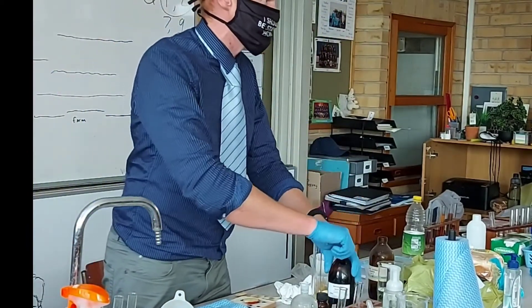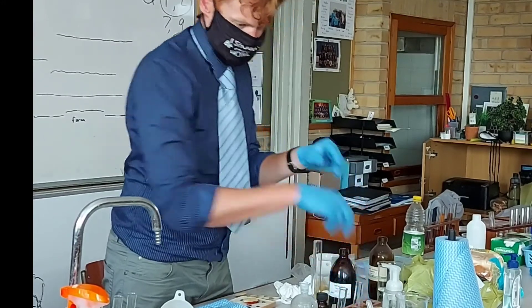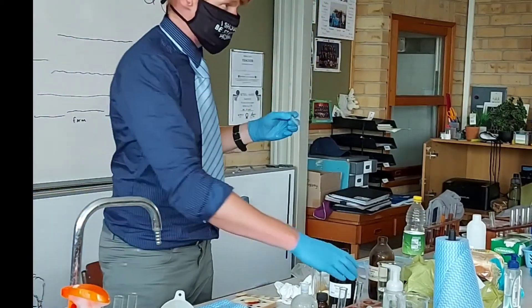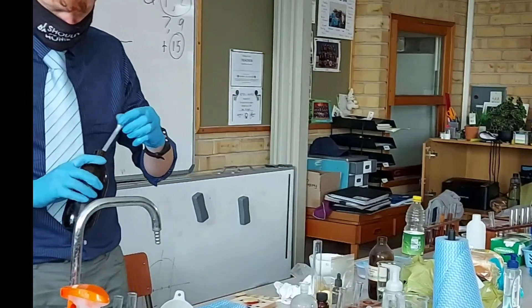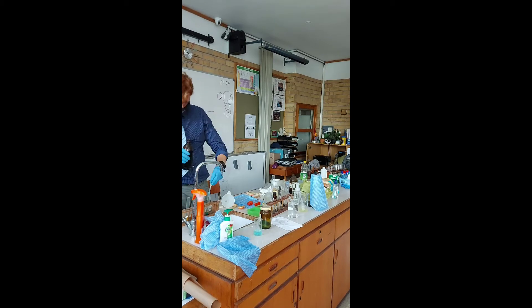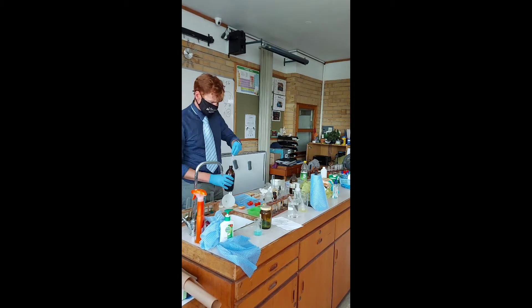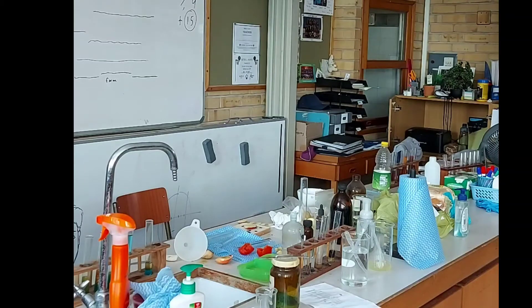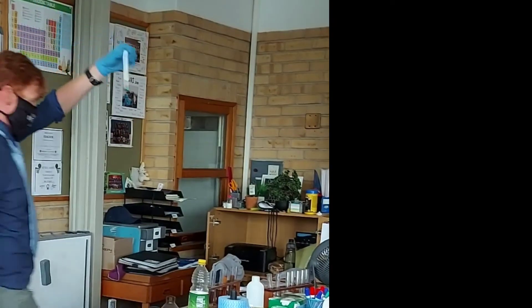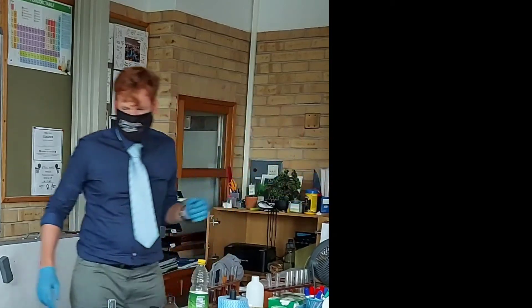How many milliliters of Benedict solution do I need to add? Four milliliters. This tube contains three milliliters, so three plus one is four. And we measure the temperature over here. I'm going to take my control — egg white — and put it in.